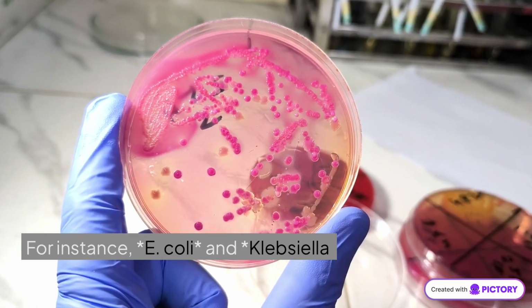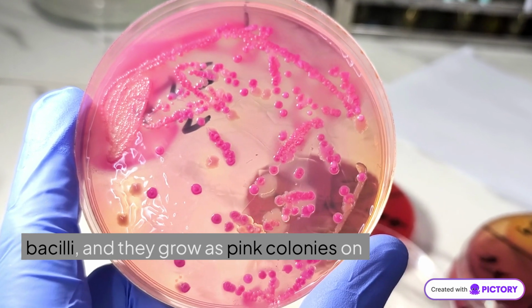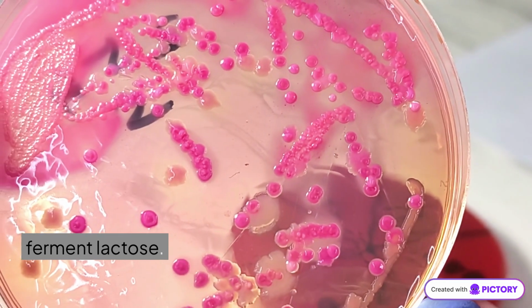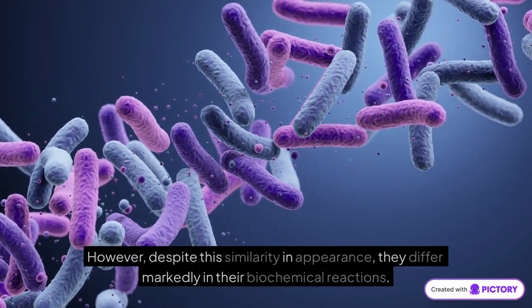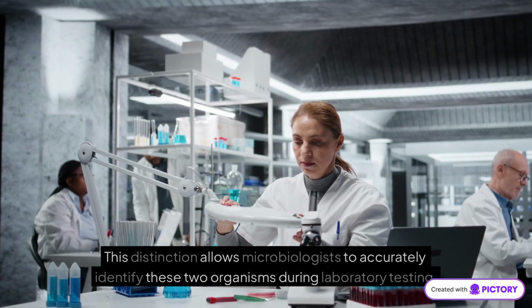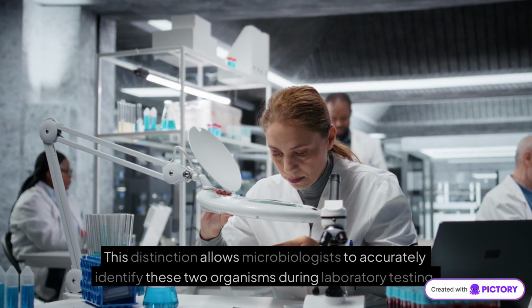For instance, E. coli and Klebsiella pneumoniae are both gram-negative bacilli, and they grow as pink colonies on MacConkey agar due to their ability to ferment lactose. However, despite this similarity in appearance, they differ markedly in their biochemical reactions. This distinction allows microbiologists to accurately identify these two organisms during laboratory testing.